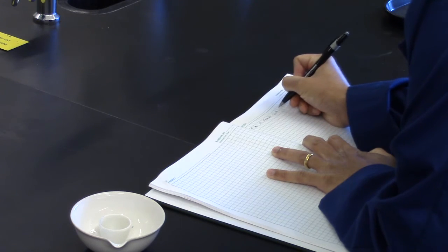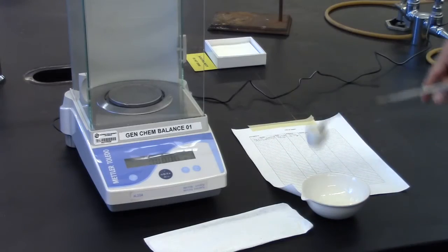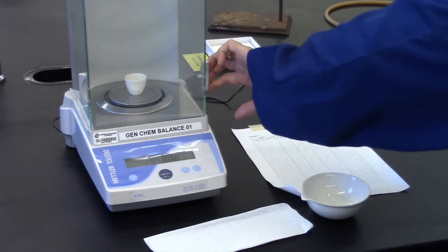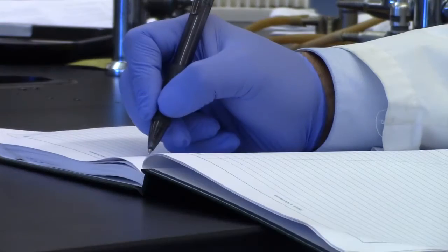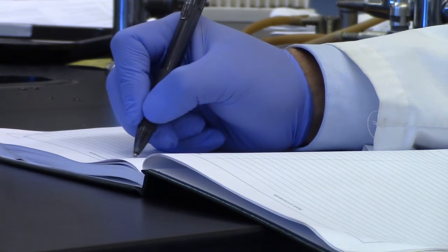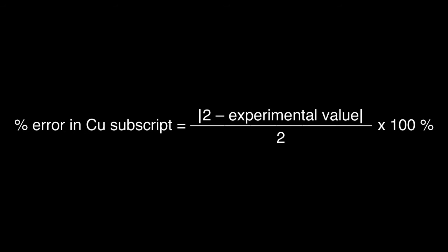While you are waiting for the crucible to cool, calculate the moles of copper. Once cooled, weigh the crucible plus product to 0.0001 grams using the same analytical balance. Next, calculate the moles of sulfur that reacted with the copper. Your collected data should be as follows. Now, with this information, the empirical formula may be calculated to determine the percent error.